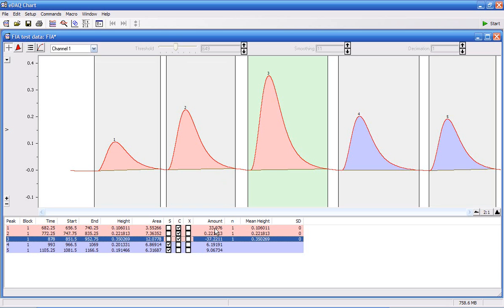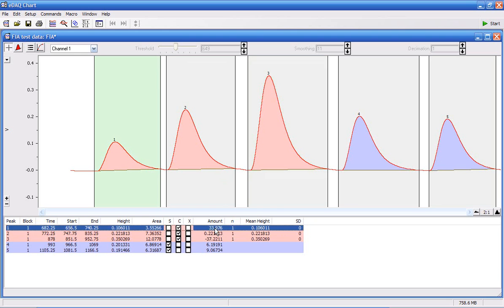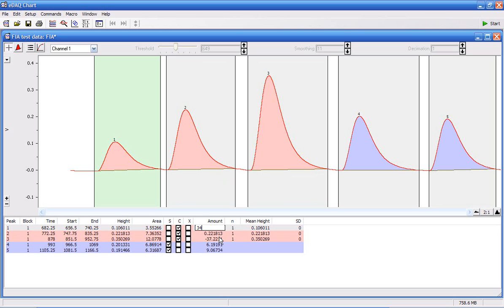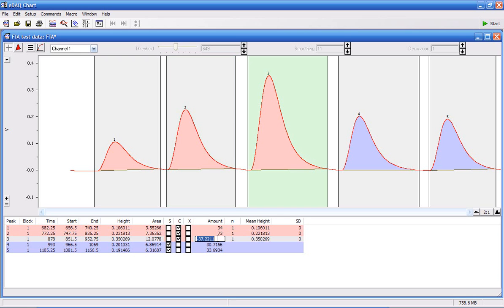You can type in the amount, the concentration of those standards. So for this, I'm going to pretend it's 34 ppm, 73 ppm, and this one will be 120 ppm.